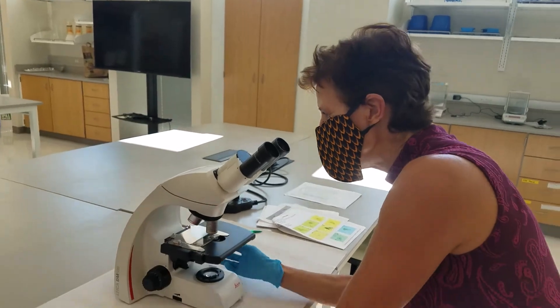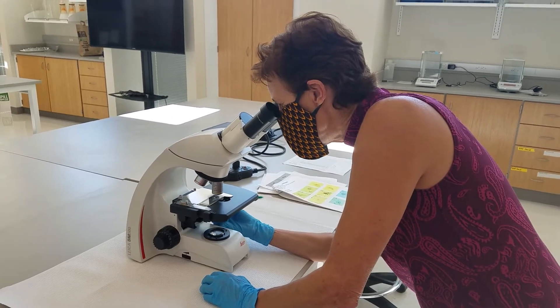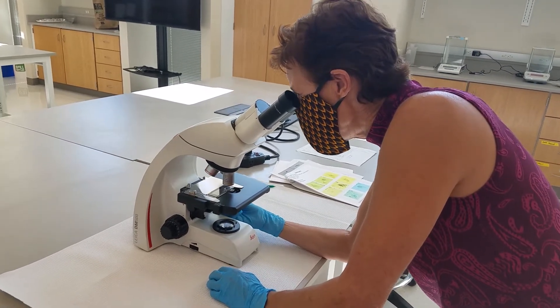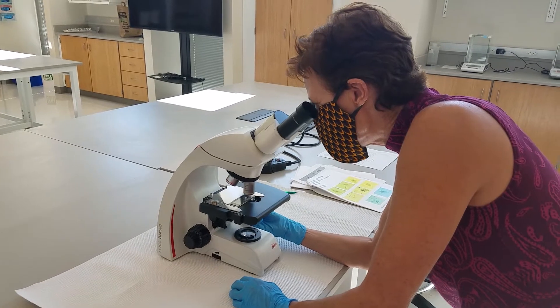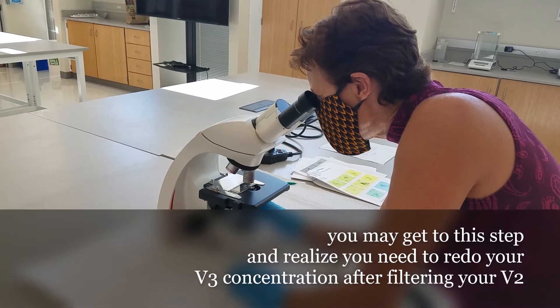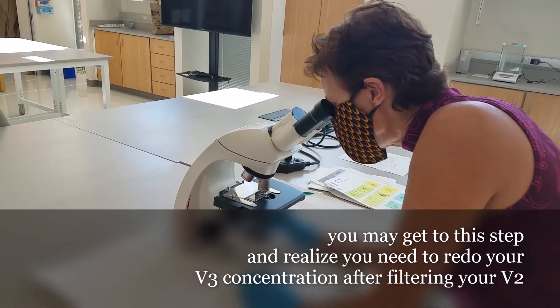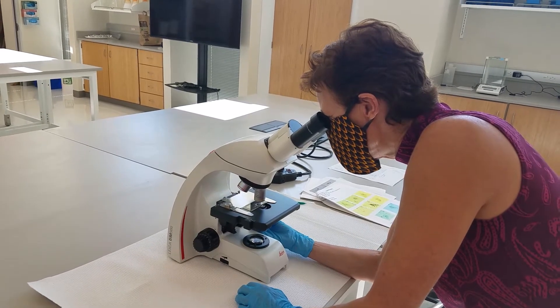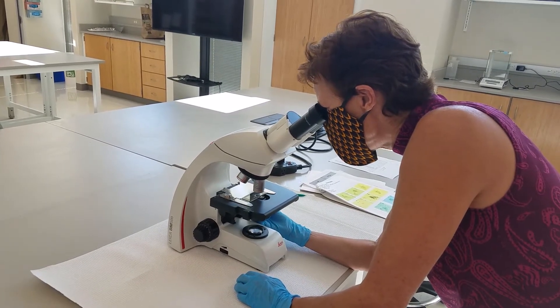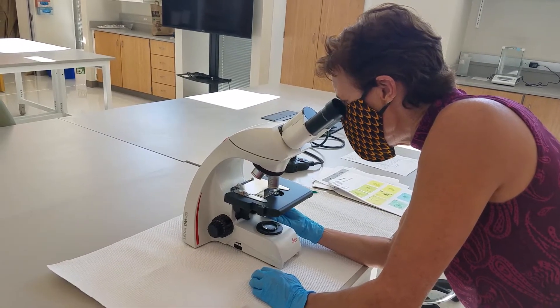What I normally do now that I've got good magnification is do a full view — go around the whole slide to see what's on there and whether I have a reasonable number of organisms, or whether I need to go back and concentrate the sample more. I can tell you that the sample, even though it looked like it had a lot in it, it's mostly algae. So I would probably go back and concentrate the sample a little bit more.